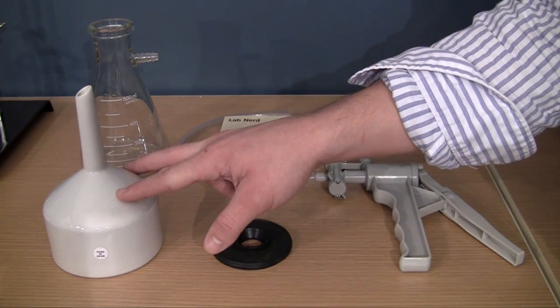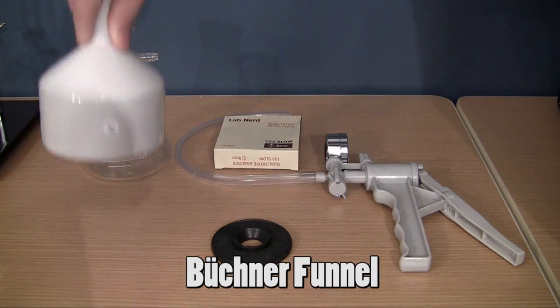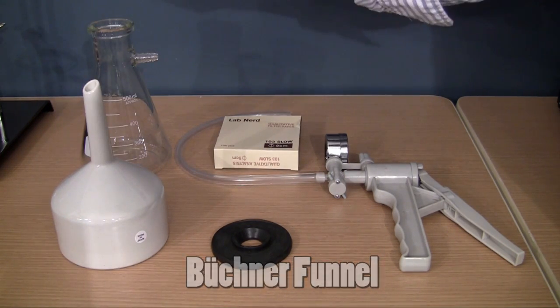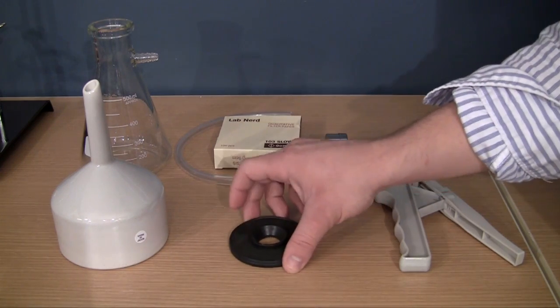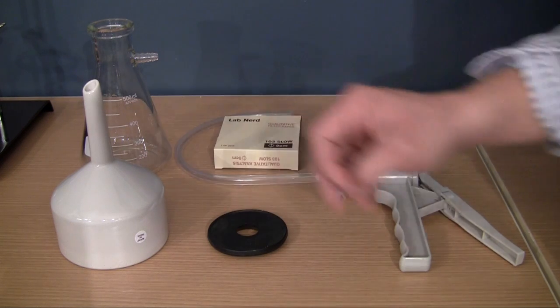This thing right here is called a Buchner funnel, and this is essentially going to go inside here, and it just makes pouring the mixture in a little bit easier. And aside from that, you have a rubber stopper, and this is just to make a good seal between the funnel and the flask.